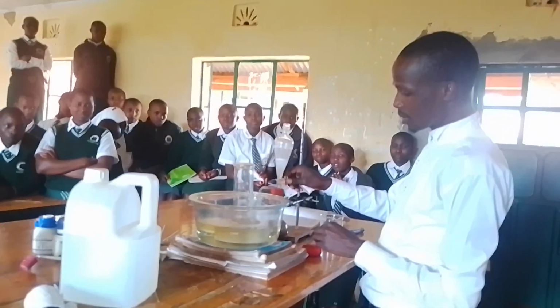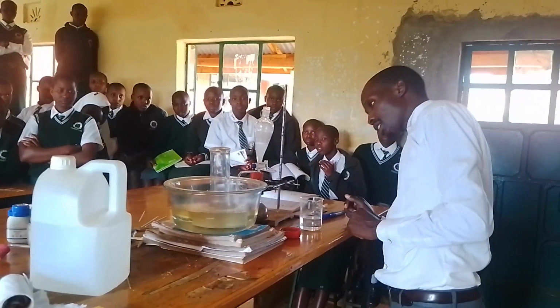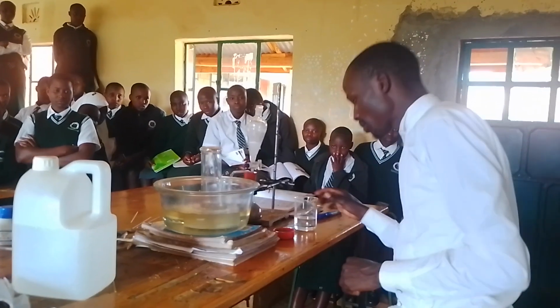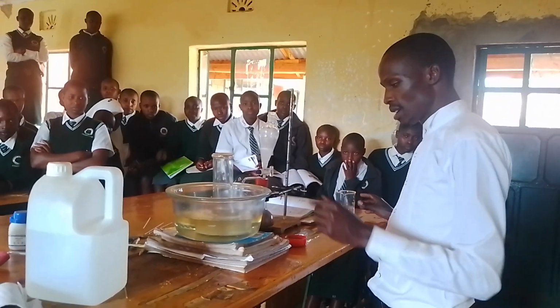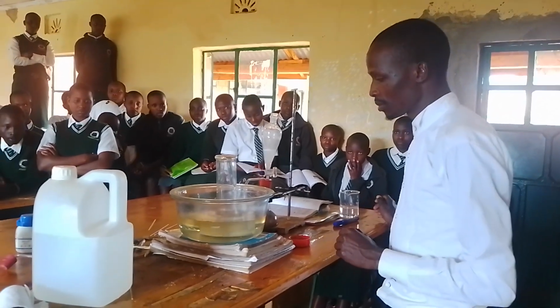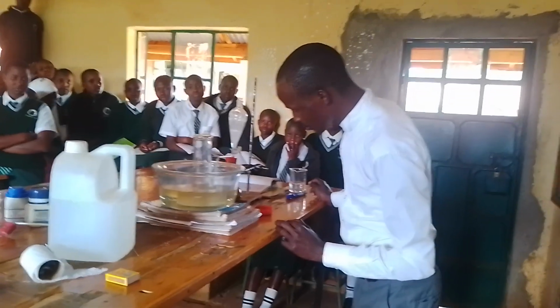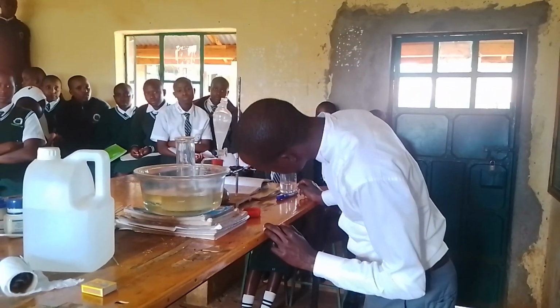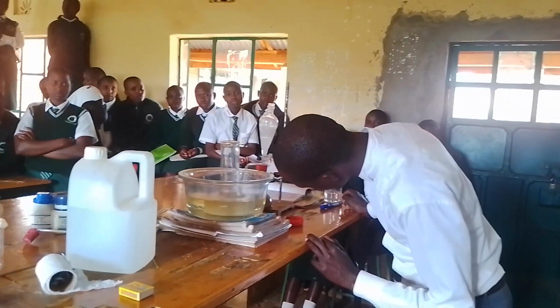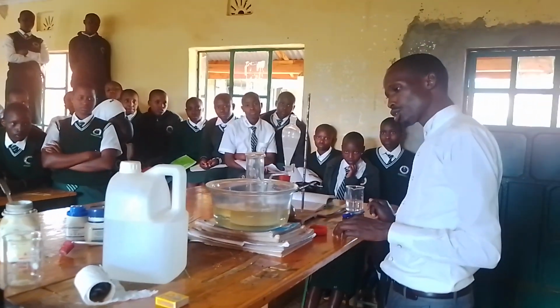The gas comes out, the bubbles come out from that other end. And then you can see we are able to collect a gas. Is that okay? Yes, inside here we are collecting a gas. And we will be careful to observe that there is a reaction which is ongoing.